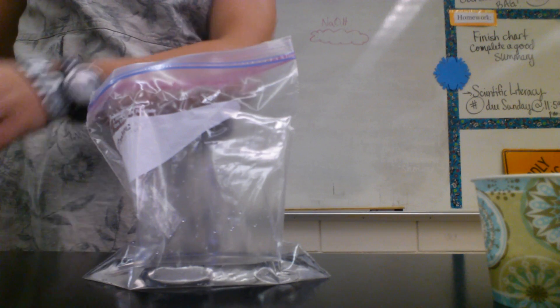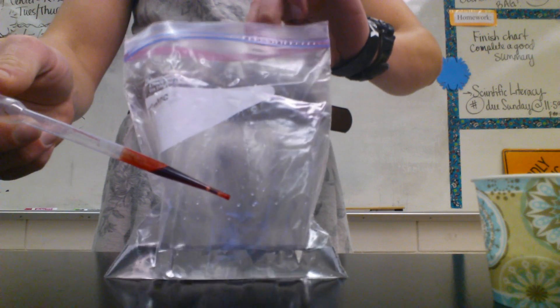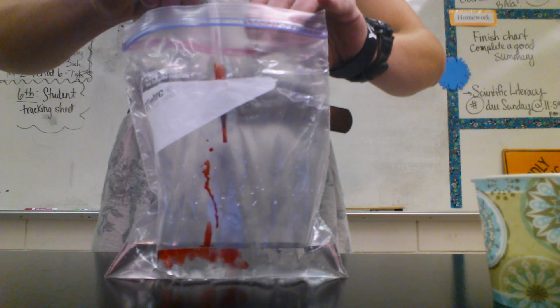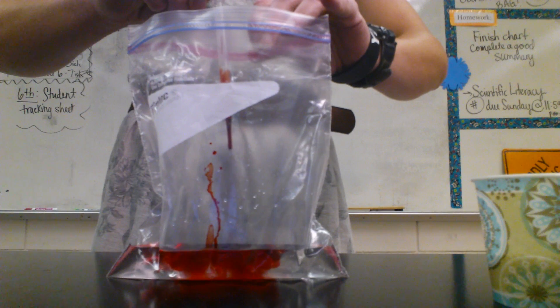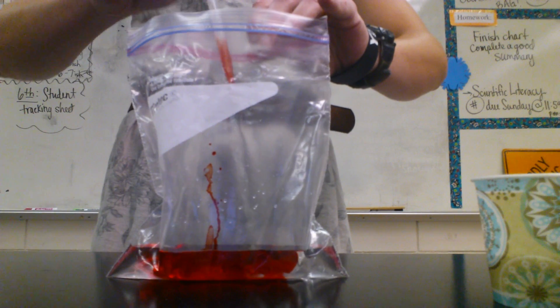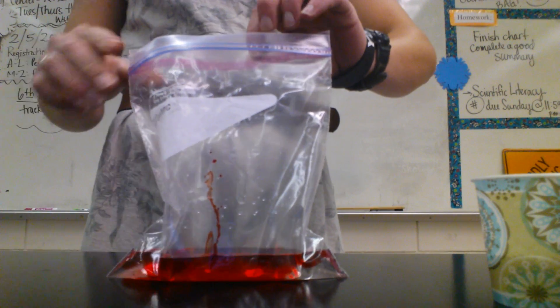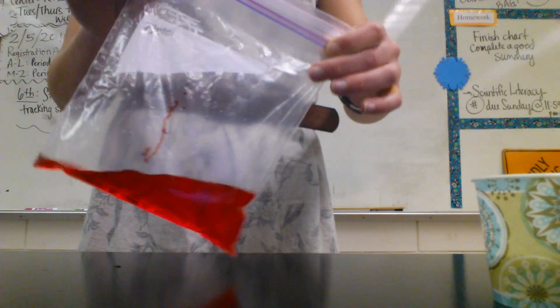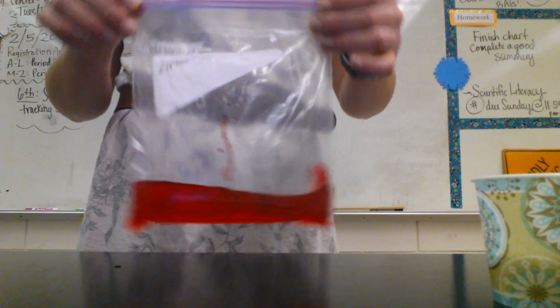The very first reaction we see is just between phenol red and water. When I drop the phenol into here, you can see it automatically starts to disperse. This is just a physical change because all that's happening is our phenol is simply spreading out. Make observations in your chart about what's going on here. How do you know it's a physical or a chemical change?